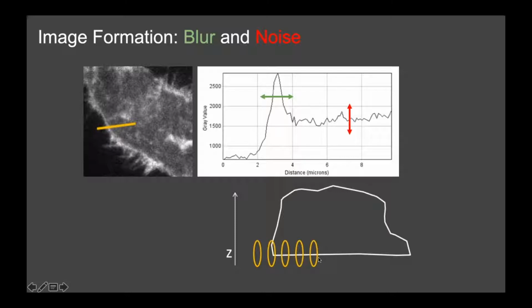So this increase in intensity could be just an artifact of your imaging. So this is another thing. If you do bioimage analysis, you have to be very careful to know which microscopy technique was used, what was the resolution, and so on, not to interpret your data wrongly.